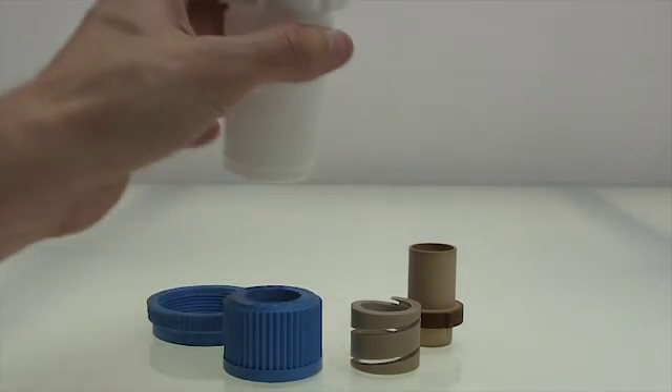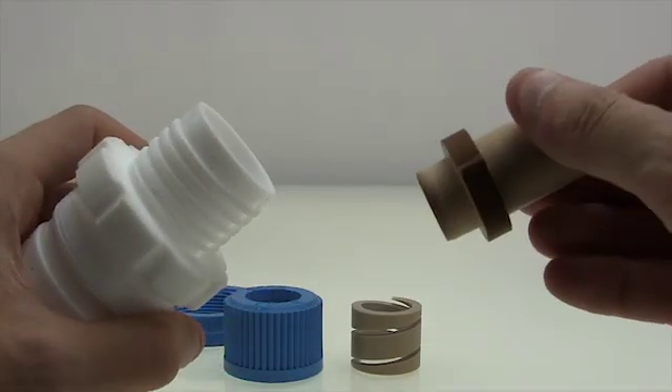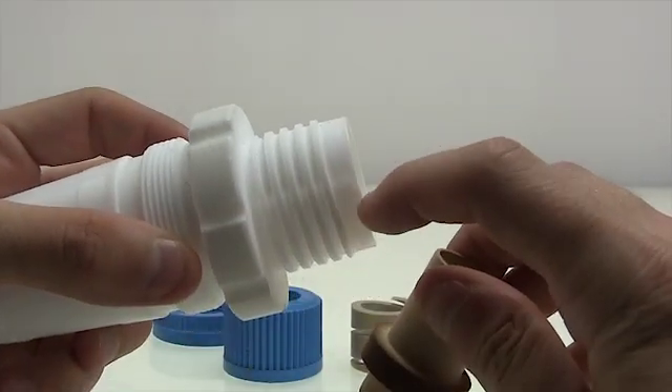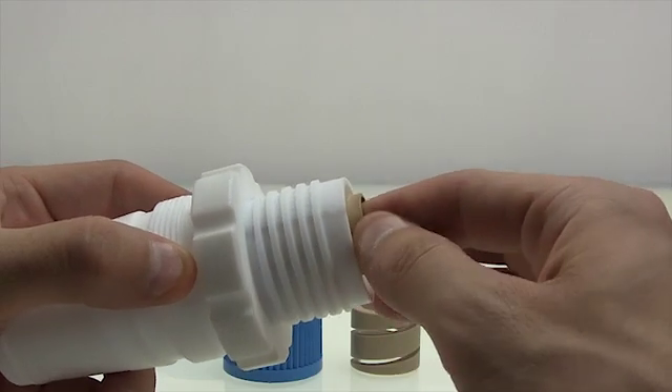First, take your PTFE adapter and insert the sleeve. You'll notice it has a notch right here, as does your PTFE adapter right here. Make sure to line them up and then just insert it.